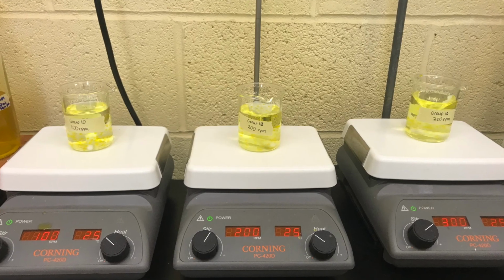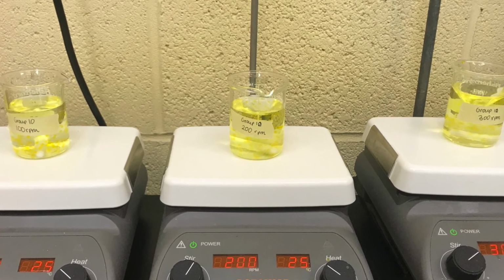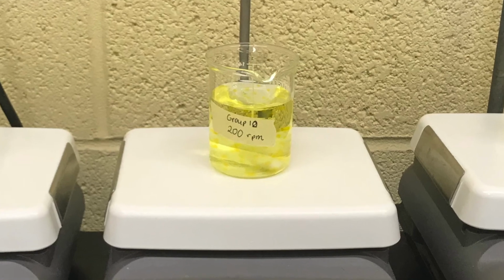Overall, this experiment allowed us to model the rate a drug is metabolized in the body. Based on our results, we found that increasing the mixing speed led to an increase in the diffusional exponent and an increase in the kinetic constant. We did not find conclusive results by increasing the bead size. This could be due to experimental error.